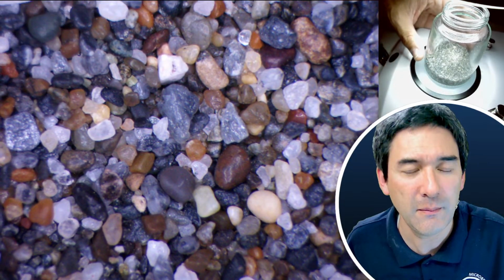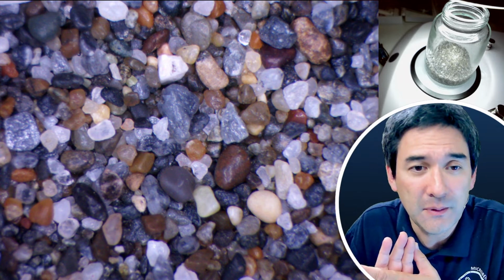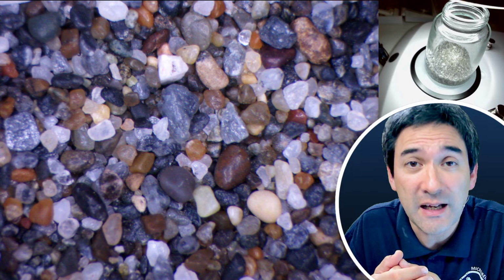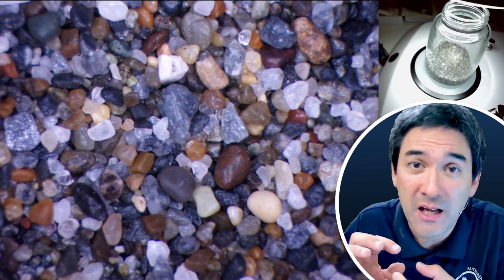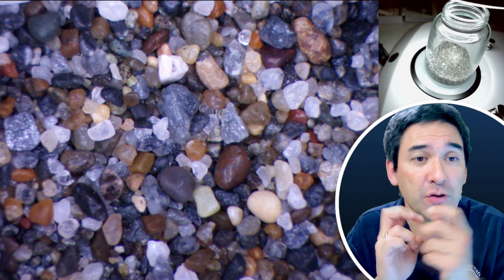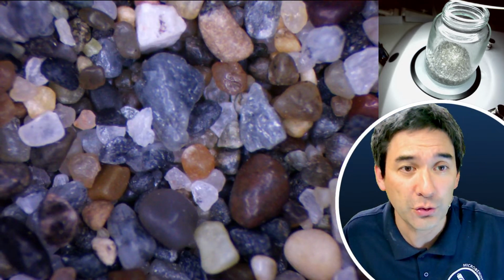And by the way, this is a way how you can actually distinguish natural sand versus artificial sand, for example crushed sand. I recently made a video where I put some artificial sand under the microscope, and this artificial sand was used to make, for example, sand sculptures. It has to be artificial sand because there are more edges in the sand grains, and this causes a tighter interlocking of the sand grains. And if you see round sand grains like this here, then you know that they've become round because of natural erosion processes, and therefore this is not crushed sand.